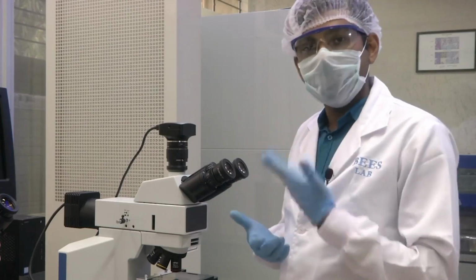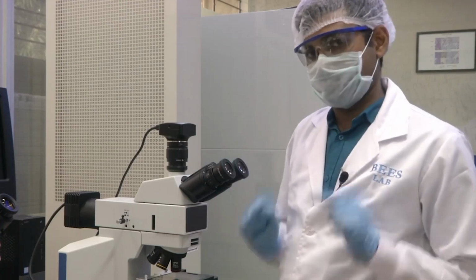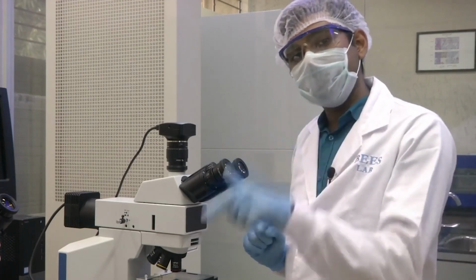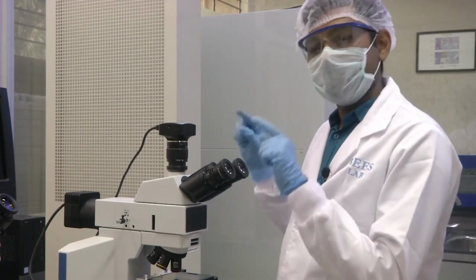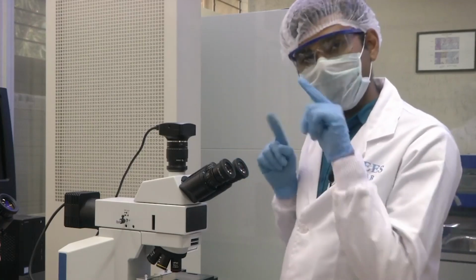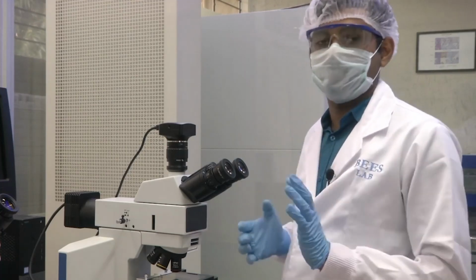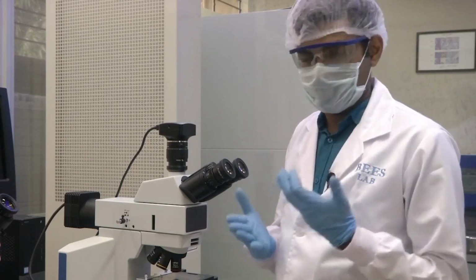When you look at the image, you will see light coming out from only where the nucleus is present, because that chemical DAPI went and interacted only with the nucleus of the cells. So, in the image you will see blue color dots throughout your field of view, and those blue dots will correspond to the nuclei of your cells. This is the basic method in which fluorescence microscopy works.